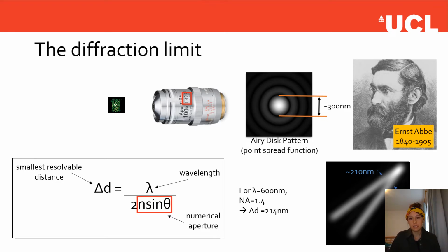And you can imagine this can be really, really problematic, right? So for this simulation, we have context. We're like, okay, cool, I'm pretty sure this is some kind of V-shaped structure. But if we didn't have the added context of our low resolution structure that we could resolve, if we just had this, you have no idea what's within that blur, which is why resolution is a bit of a problem.